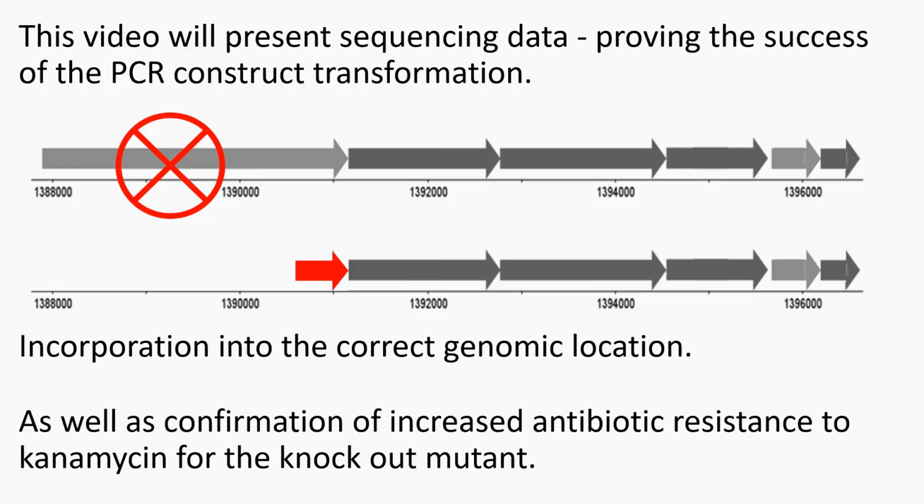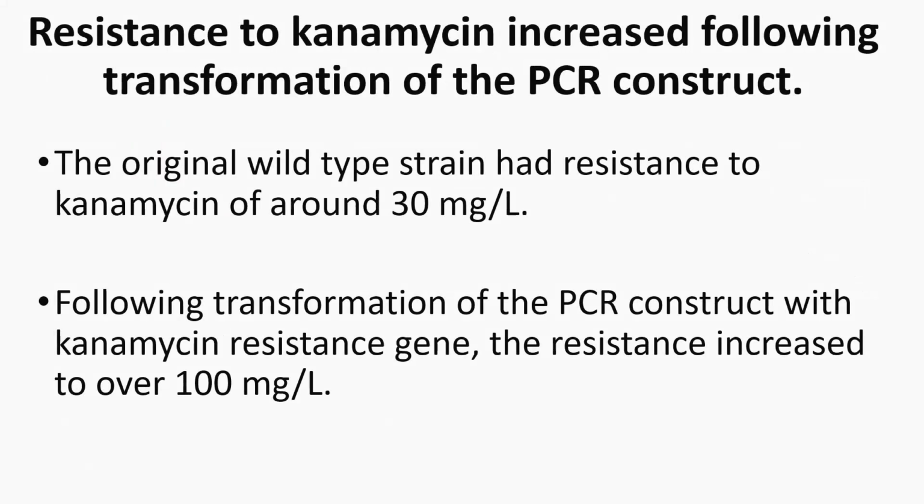I will also show the effect of the kanamycin gene insertion. This is highlighted by a significant increase in resistance to kanamycin. The original, wild-type strain had a resistance of around 30 mg per liter. Following transformation, resistance to kanamycin increased to over 100 mg per liter.